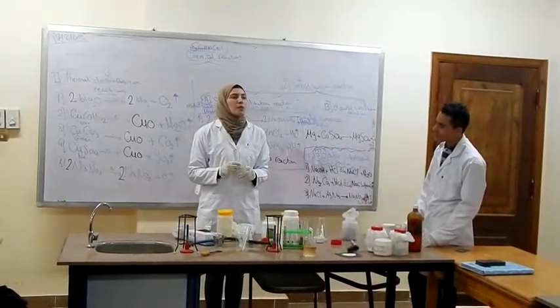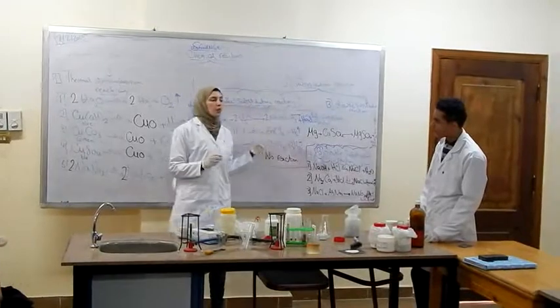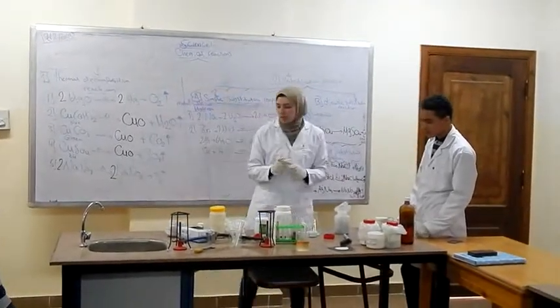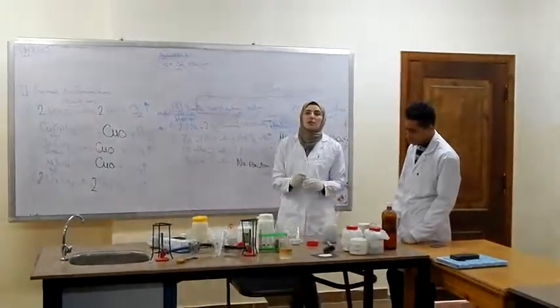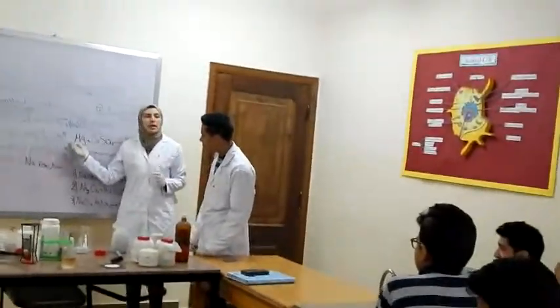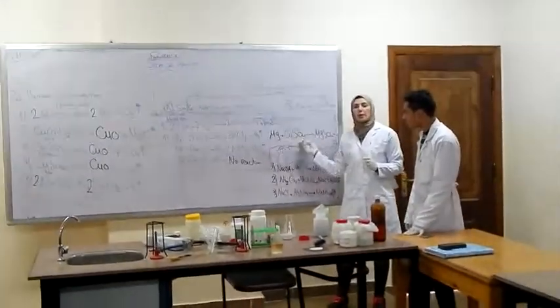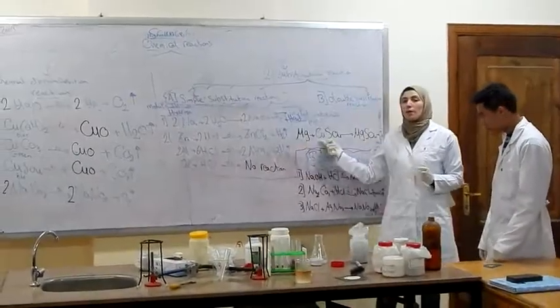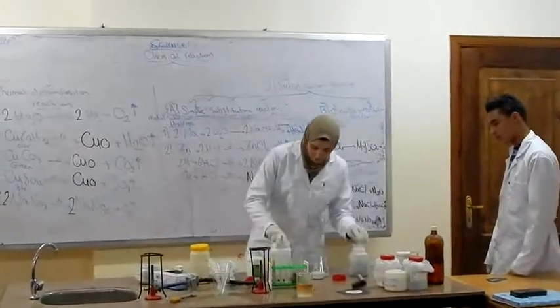Now, before the second reaction of substitution, when a metal substitutes another metal. In this reaction, we will see how magnesium substitutes copper from copper sulfate solution. Copper, magnesium, what is magnesium?